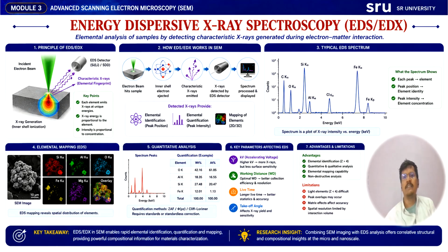Beyond imaging, we discuss one of the most powerful analytical capabilities integrated with SEM, energy dispersive X-ray spectroscopy, commonly known as EDS or EDAX.